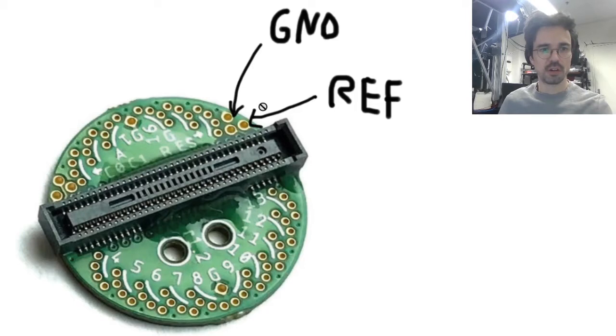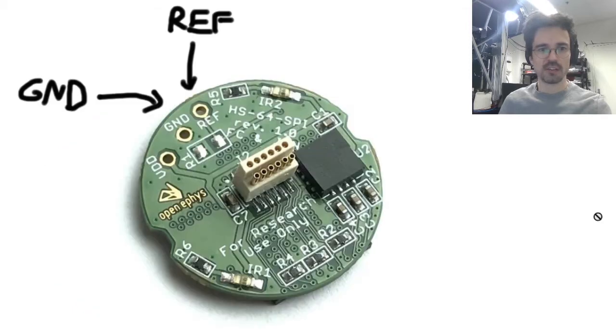You might have seen on the EIB, electrode interface board, or somewhere on your ephys system that there's a ground connection, but there's also this ref connection. This is what this looks like on our shuttle drive EIB. This is what this looks like on a head stage. So there's a ground input and a ref input. So what are these good for?